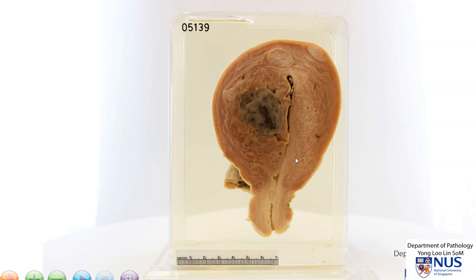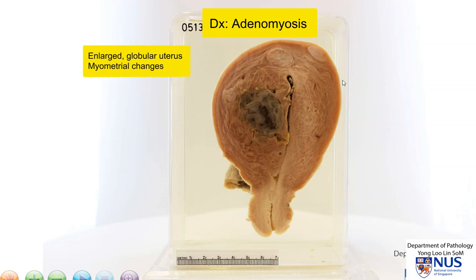These are sometimes known as punctate hemorrhages. The diagnosis here is adenomyosis. Adenomyosis usually gives rise to an enlarged, rather globular-shaped uterus with a trabeculated myometrium, and sometimes you can see punctate hemorrhages.